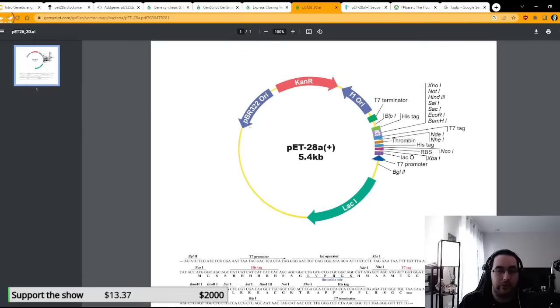The other thing you'll see is the pBR322 ORI. This is a low copy ORI. There looks like there's a void here, but there's actually other code here. It's just not annotated. The other code that's in here interacts with this particular ORI to maintain this plasmid as low copy. The other thing that's really important is this thing that says lacI, depending on how you want to pronounce it.